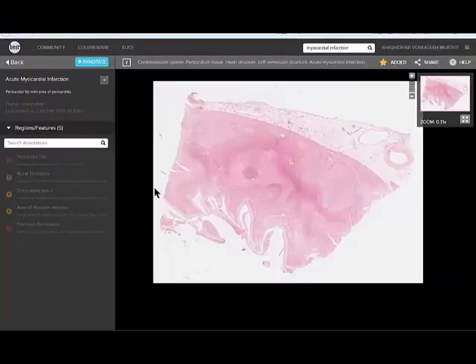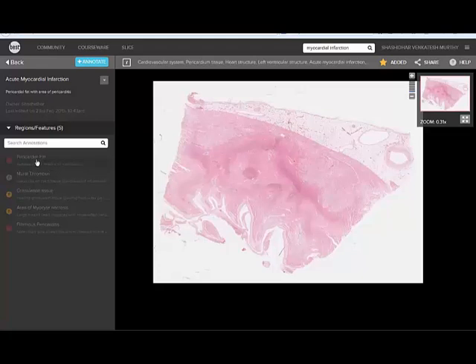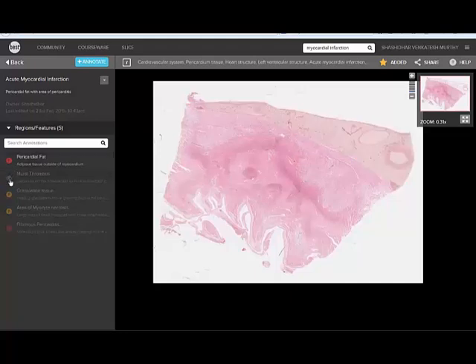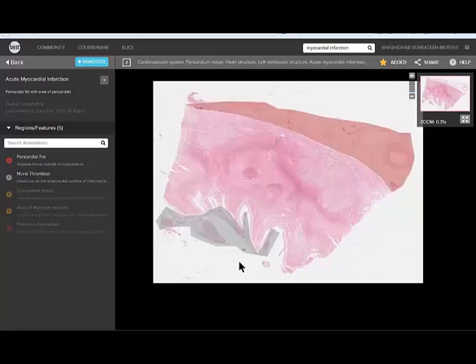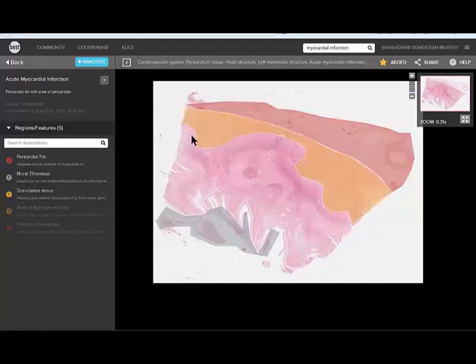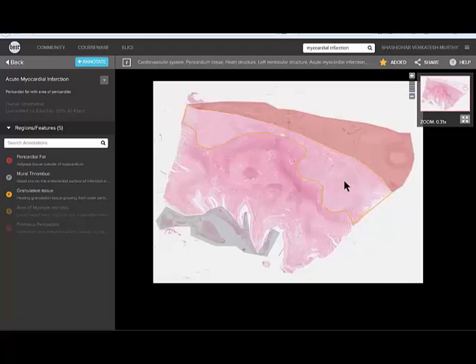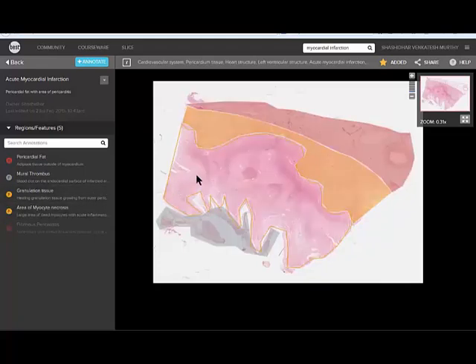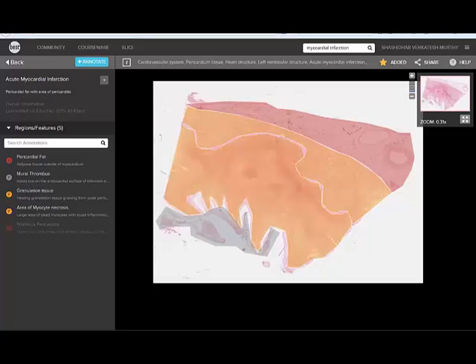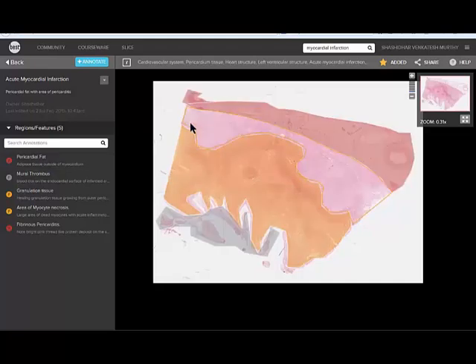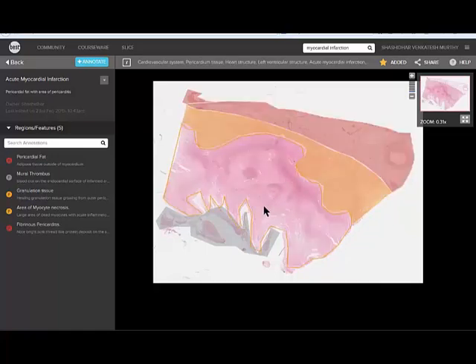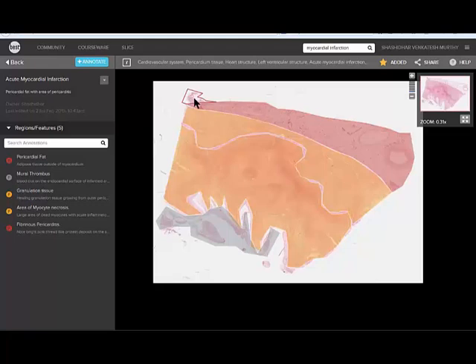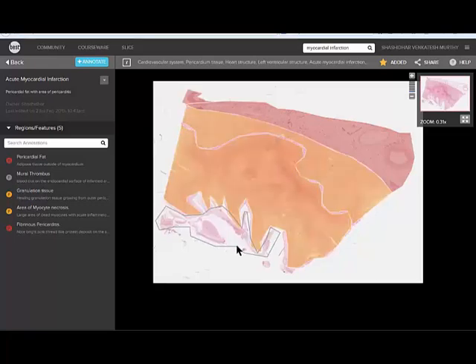In this, if I observe here, the pericardial fat, mural thrombus is inside in the lumen, granulation tissue at the outer area and then area of myocyte necrosis with plenty of inflammatory cells and then a small area of pericarditis is seen here. Hope you have understood myocardial infarction. This is a full thickness infarction with the pericarditis and mural thrombus. Thank you.